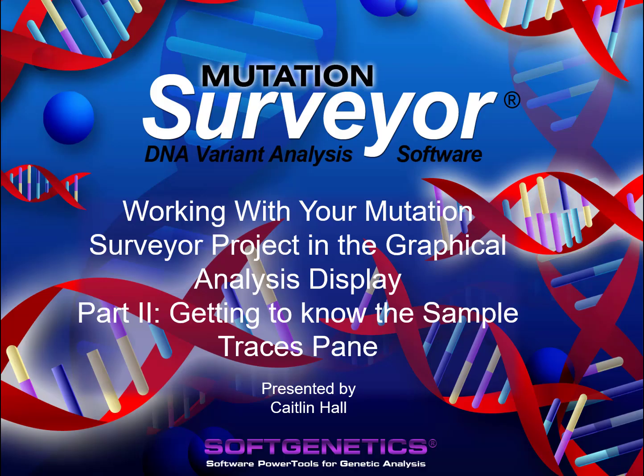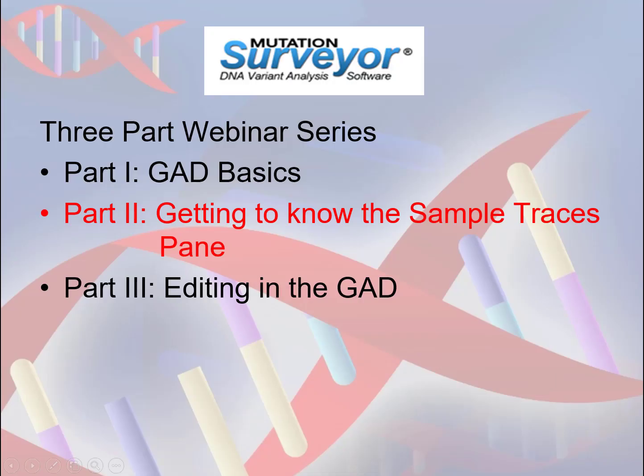Hello, and welcome back to the Mutation Surveyor webinar series, Working with your Mutation Surveyor Project in the Graphical Analysis Display. As a reminder, this is a three-part webinar series pertaining to how to use the Graphical Analysis Display, or GAD, to review and edit your project data.